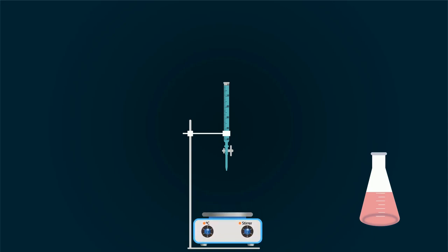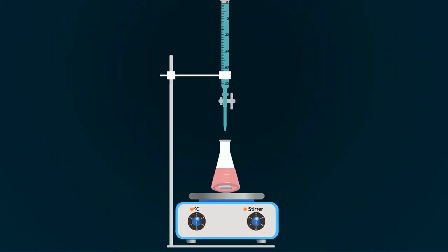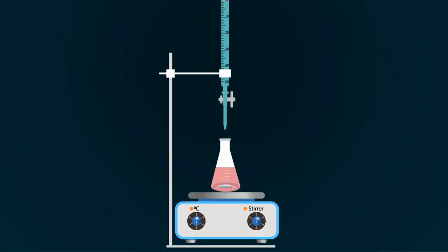Put magnetic bar into the conical flask. Put this conical flask onto the magnetic stirrer and power it on. The magnetic bar will start rotating. Now start pouring 0.1 molar HCl solution drop wise.